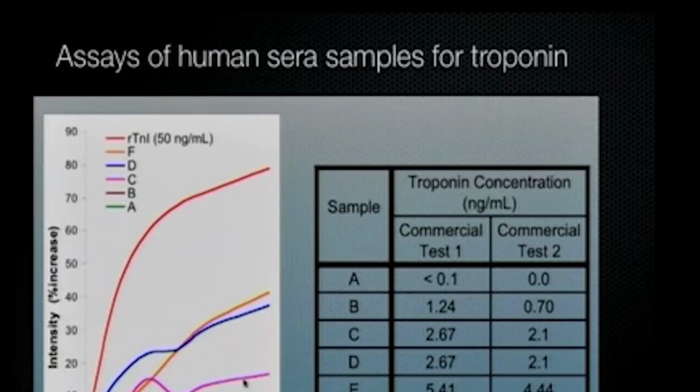That's why there are wiggles in that signal. But the interesting thing here from the point of view of clinical diagnostics is that's 10 minutes here. So in less than 5 minutes, you already have a difference between higher levels, clinically relevant levels, and clinically, absence of troponin. So in a very short time, you are able to measure the signal with high intensity.